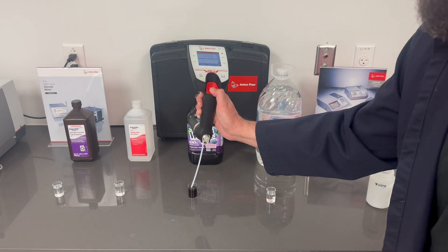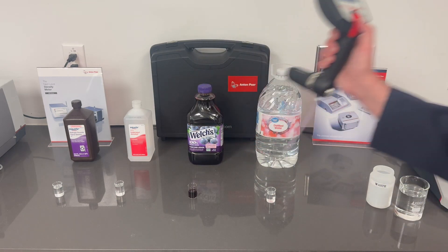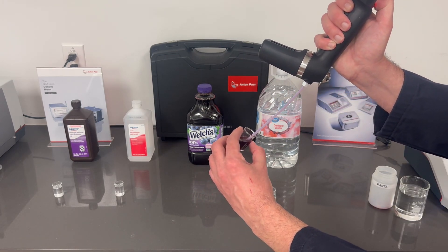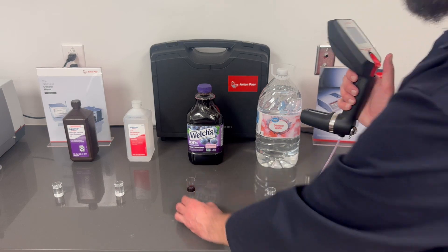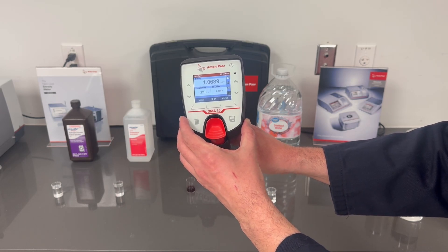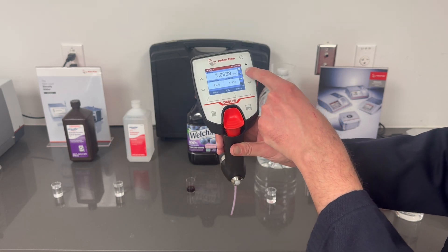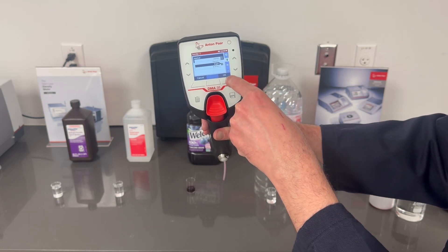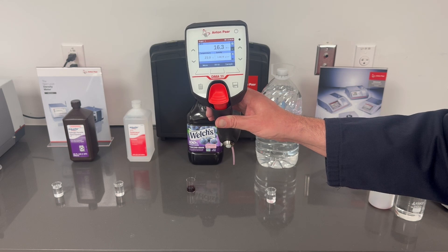I usually like to do two draws of the sample to make sure the cell is clear and full of just the sample you're trying to test. It only requires two milliliters of sample. It shows our density at 1.063 and our specific gravity at 1.0658. Let's check the Brix — we'll change our sample to sugar. 16.3 degrees Brix, right where it should be for juice.